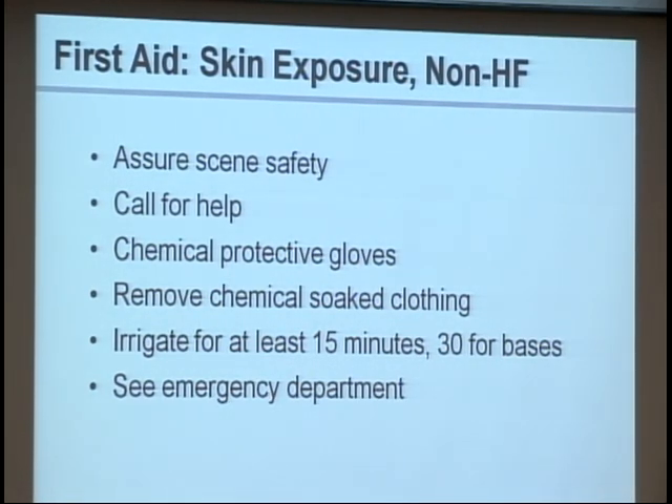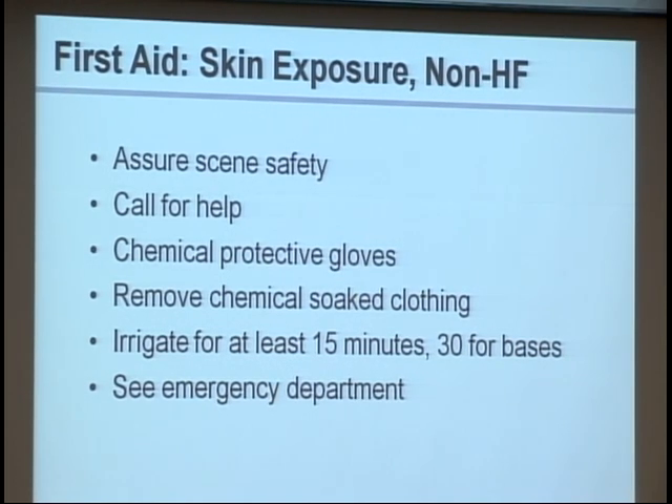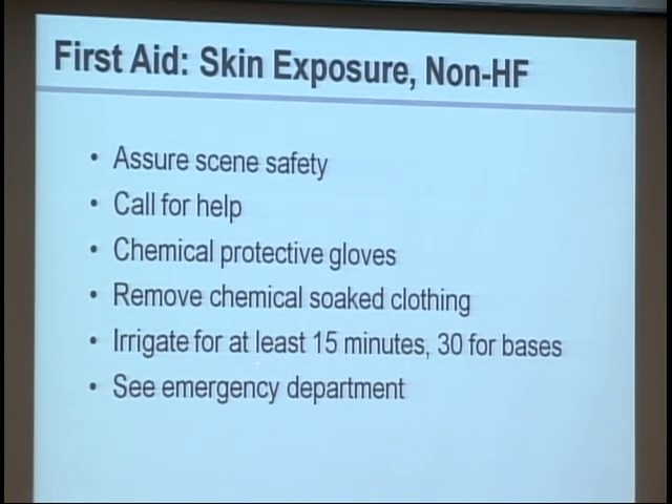For non-HF skin exposures, there's no reason to bind any fluoride — it's all about water. Simply remove anything that was exposed and irrigate continuously until the ambulance gets there. The science is: if it's an acid, irrigate really well for 15 minutes; if it's a base, irrigate for 30 minutes.